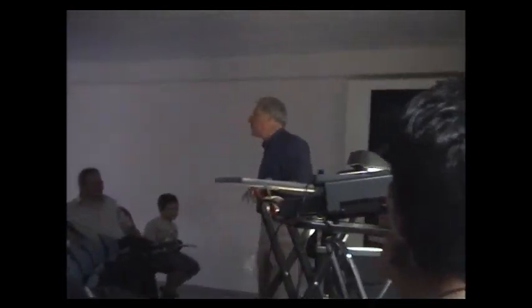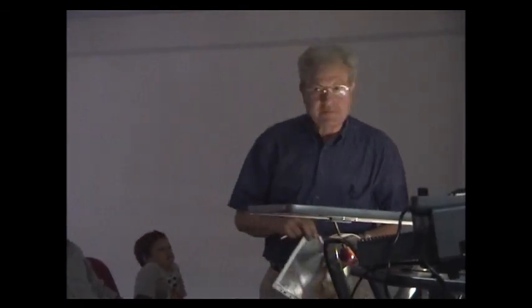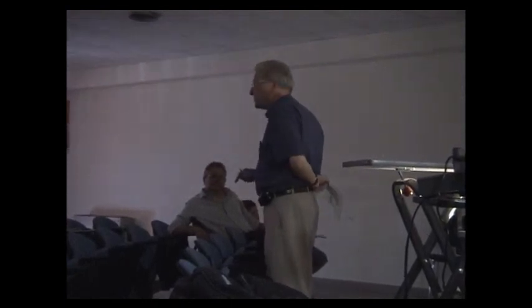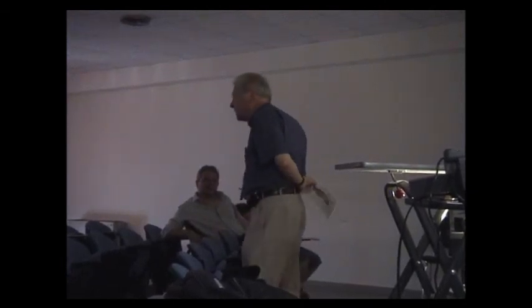And this one is a very new one, because we are now studying this kind of problem with some dentists of the University of Brussels. I give you only two or three words on the subject, because this is probably very amazing for you. It is known that when you irradiate the teeth with a laser beam, the number of caries will decrease. There is a big problem between dentists. Is it necessary to irradiate the teeth with a laser beam before applying fluoride or after applying fluoride?